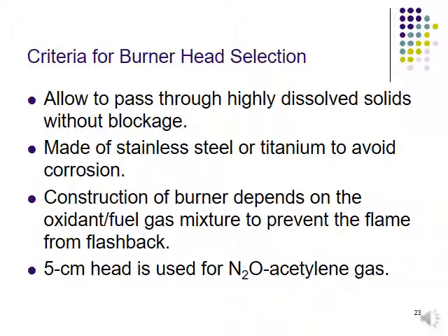In order to choose the burner head, you must consider the following criteria. The first one is to allow highly dissolved solids to pass through without blockage. Before the sample passes into the burner, it must pass through the nebulizer, so at this stage you must make sure that no blockage occurs in the nebulizer. Next, it should be made of stainless steel or titanium to avoid corrosion.